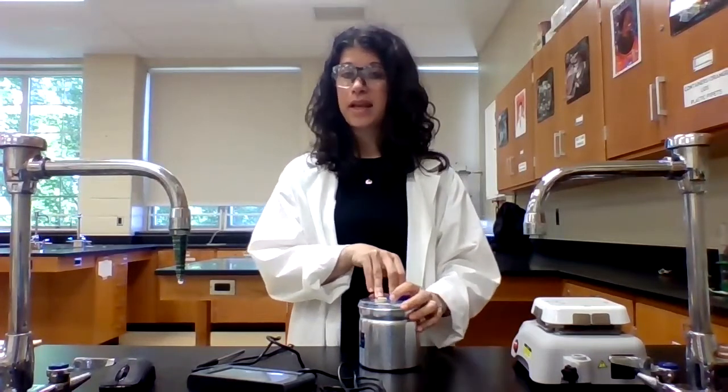So in this experiment, we're going to be verifying Hess's law. We're going to do 3 different acid-base reactions. We're going to measure their temperature over 3 minutes, and then use that data to ultimately calculate the delta H for those reactions and see if those delta H values add up the way that they should using Hess's law.